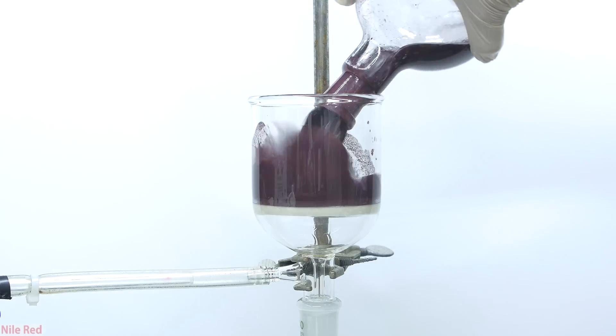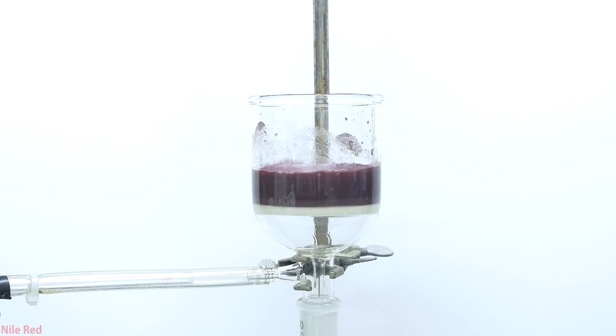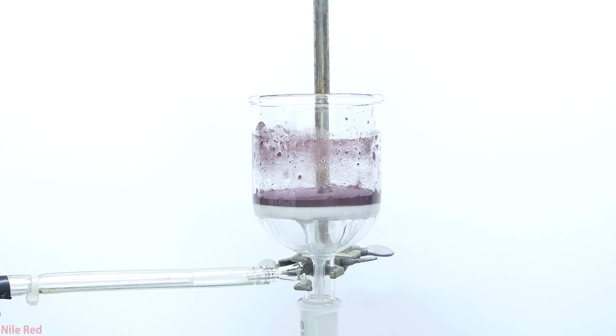To completely clean out the flask and remove all of the red phosphorus, I simply just do a few water washings. Once all of the red phosphorus has been added to the filter, I pull a vacuum and try to get rid of as much of the liquid as possible.